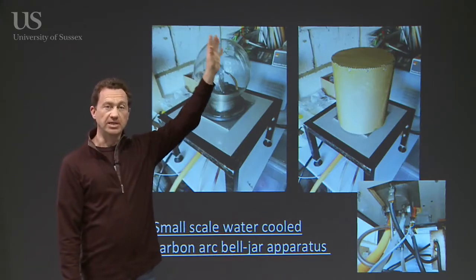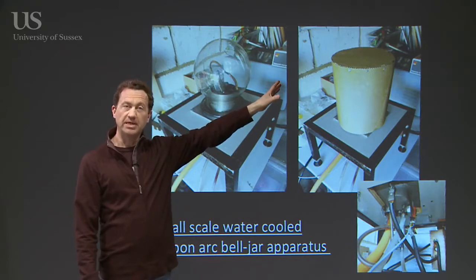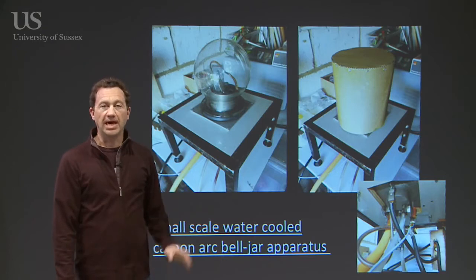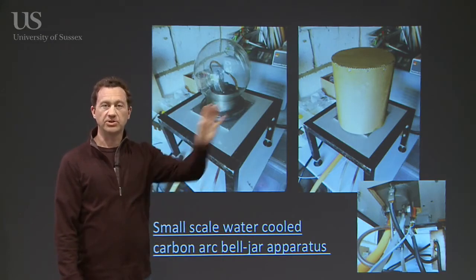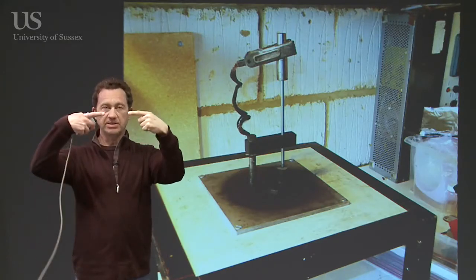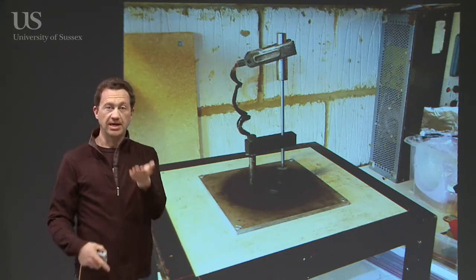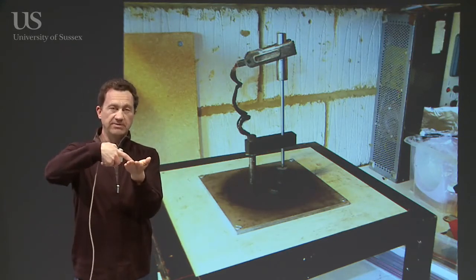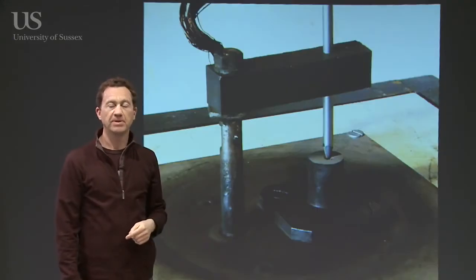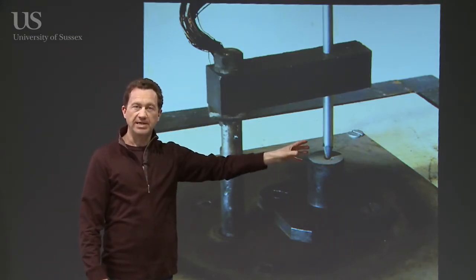This is the apparatus I'm using at the moment in the lab. You can see there's a glass bell jar here — we usually cover it up because it gets very hot and it's also run under low pressure. The whole thing is water-cooled underneath with tubing to keep everything cold. Rather than having two carbon rods touching each other, I've got a vertical rod touching a piece of carbon at the bottom. There's a close-up: a carbon rod here and a carbon base here.